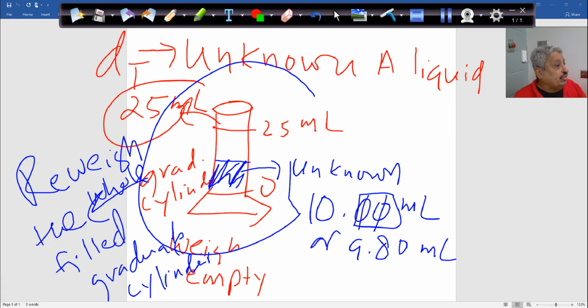I would recommend we put it at the end. If the time permits, we'll do it. If the time does not permit, we won't. This is not challenging. The challenge here is those two metals, the metal shots here, and this metal here as a cylinder. Those are the challenging part. And the most difficult one, because of the air pockets, as you can see, is the sand and the sodium chloride.